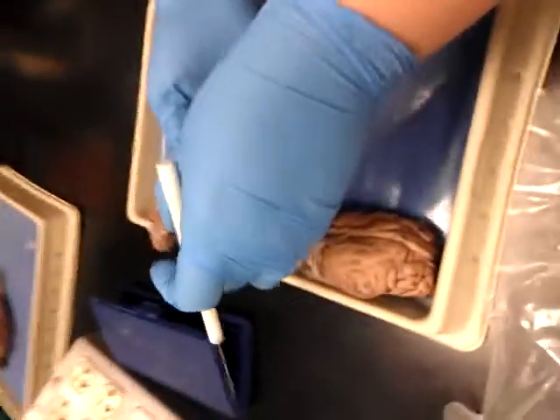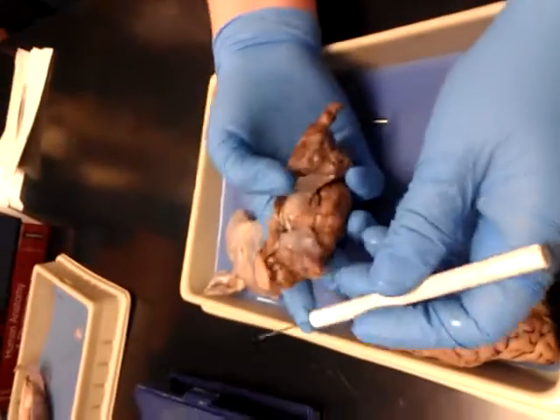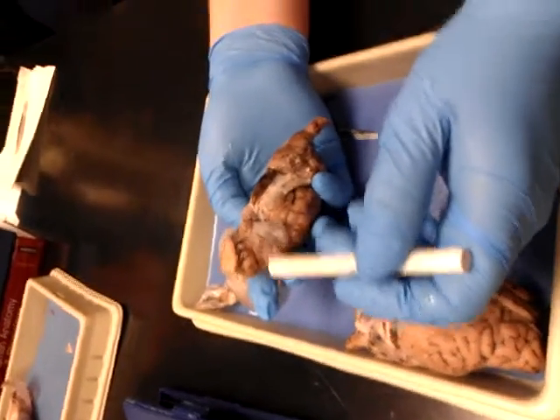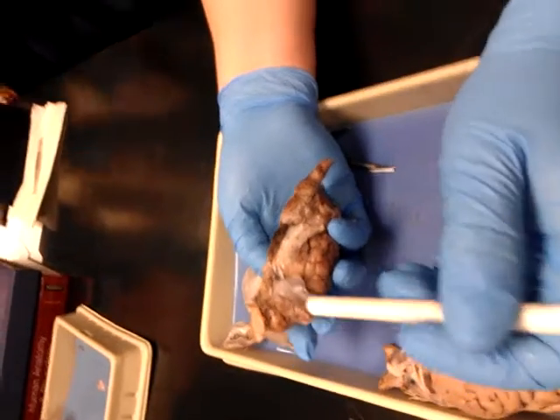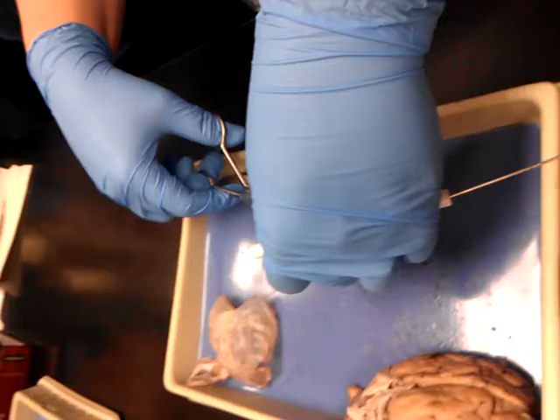Out here in the front, you're right way out here, you can't see it very well — there it is. See that? That is your olfactory bulb, okay? Where's that? Right up front, way on the frontal lobe.